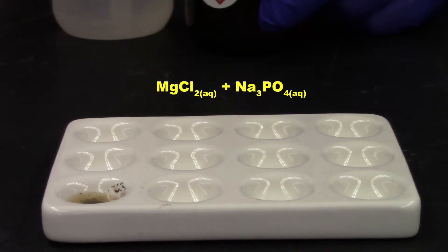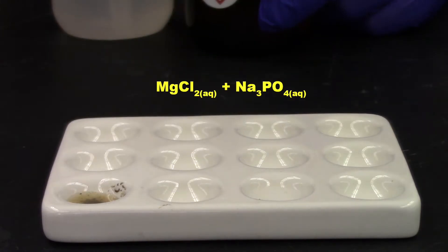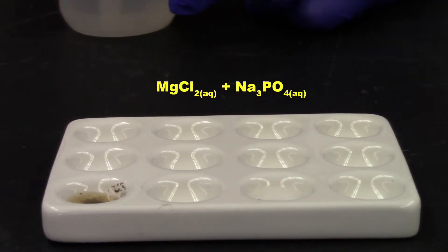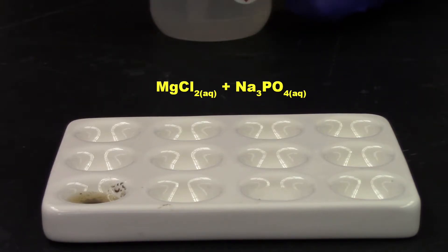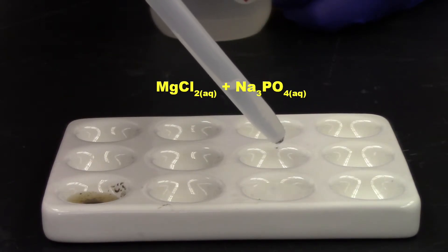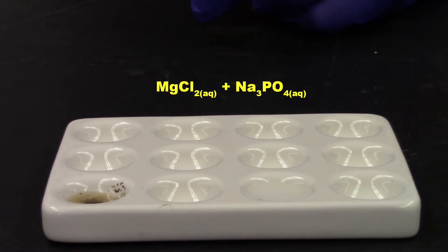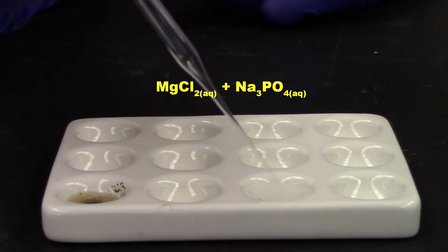So here's the magnesium chloride. Clear, colorless liquid again. Sodium phosphate. Another clear, colorless liquid. All right. Now, so far, it looks like nothing's really happened. But let's take a closer look, shall we?